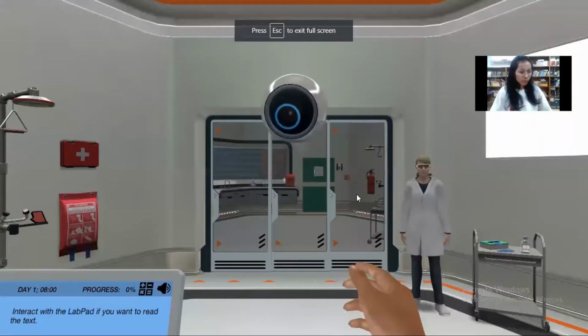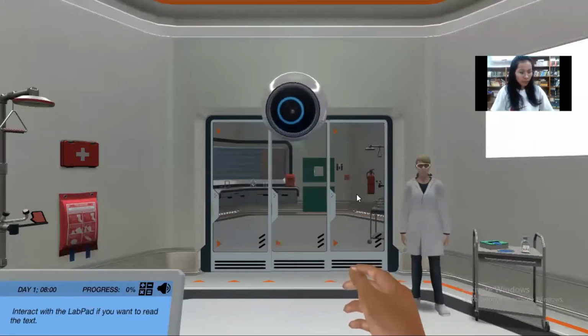Hi there. Welcome to the Chemistry Safety Simulation. Here you will learn how to safely work with dangerous chemicals. Are you ready to learn these skills to save a life?